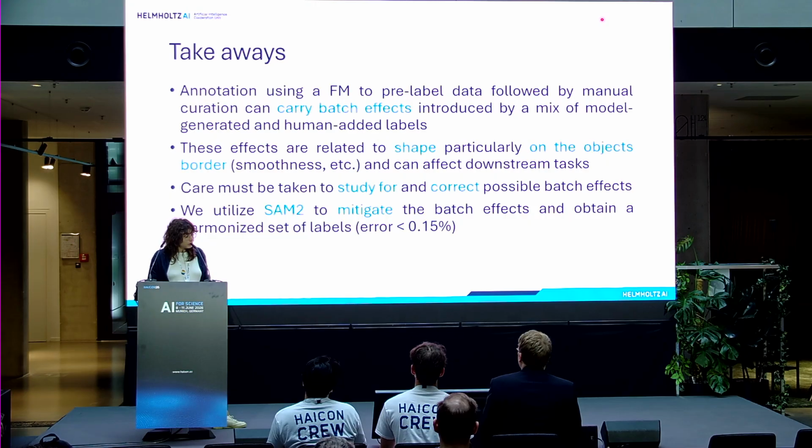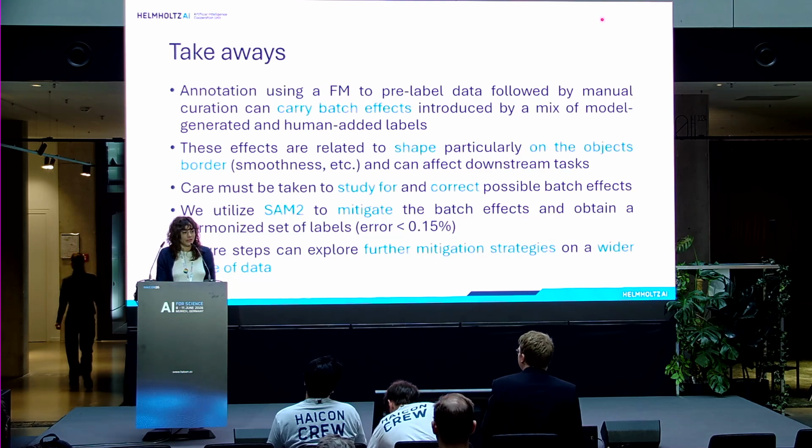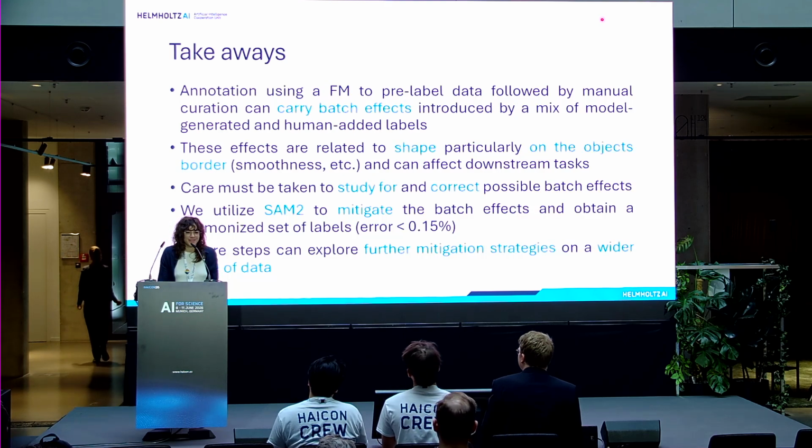We used the SAM2 model to mitigate the batch effects, and it worked pretty well in our case, but of course one can also explore further mitigation strategies and do that on a wider range of data. Thank you very much.